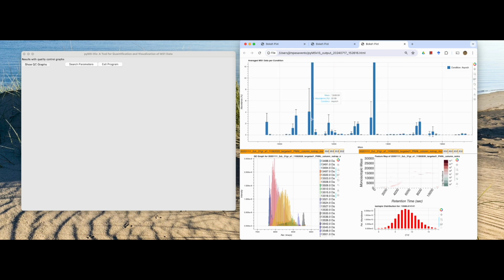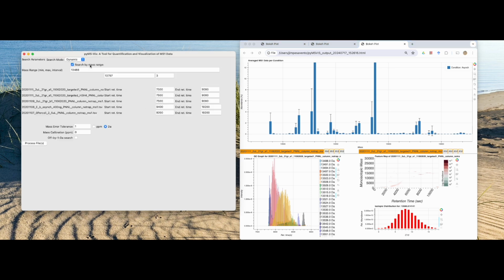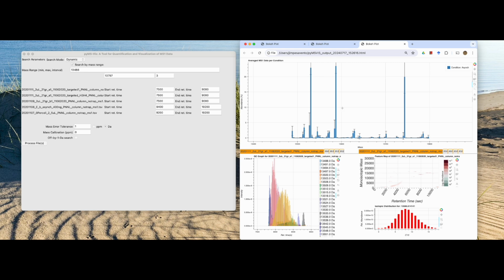I think some of these masses, for instance, might be related to one another because the window is so small. But that option is still available for more investigative searches, where if you're afraid of missing something, it might pop up with this search.